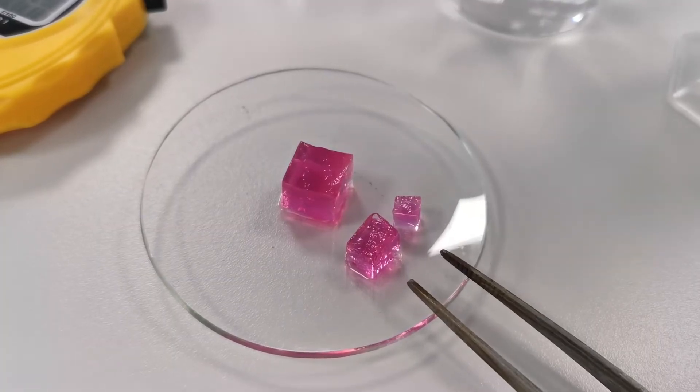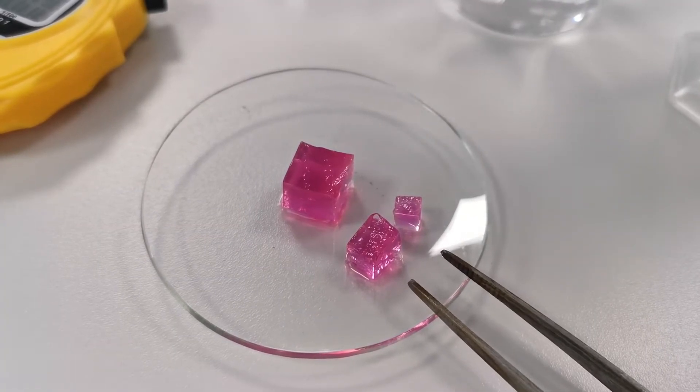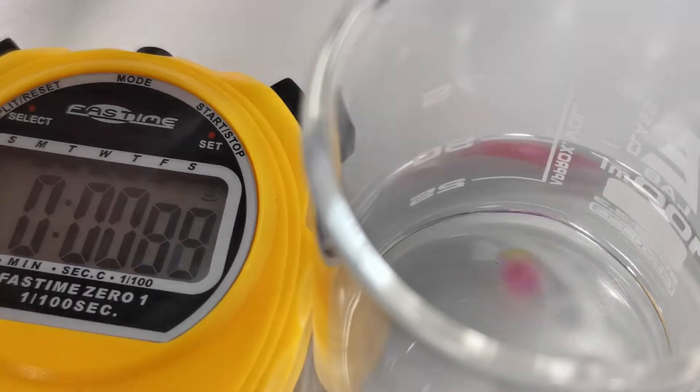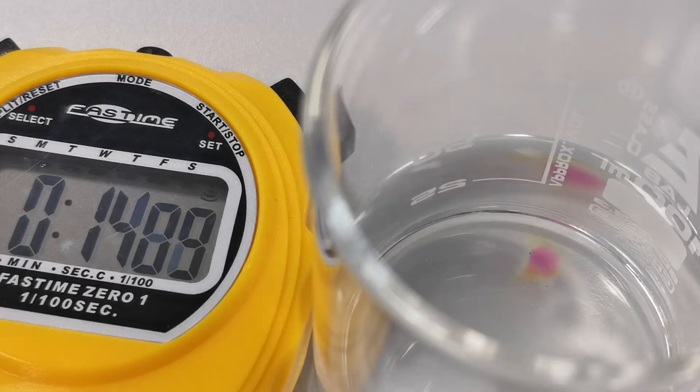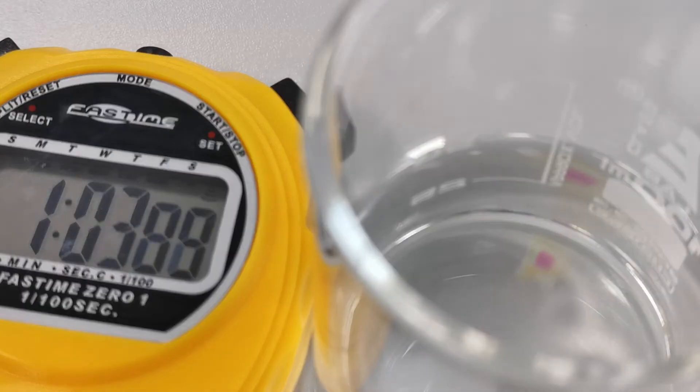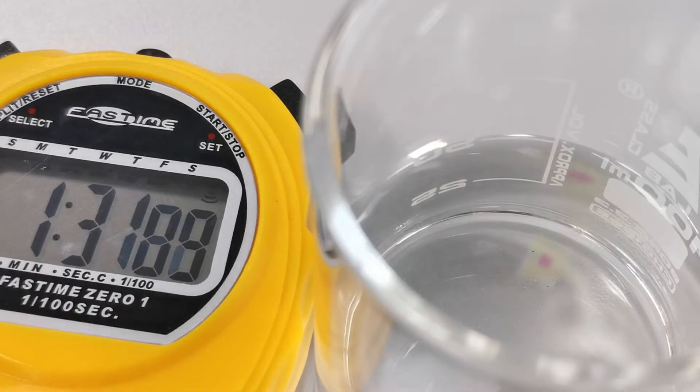Now let's start with the smallest agar cube. The height, width, and length are all 0.5 cm. Let's carefully place this into the beaker of hydrochloric acid and start the stopwatch. Now observe closely as the hydrochloric acid will begin to diffuse into the agar cube reacting with the phenolphthalein indicator. We will stop the stopwatch when all of the cube is colourless.